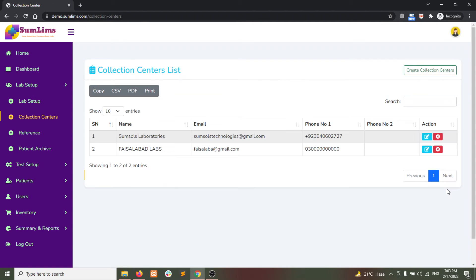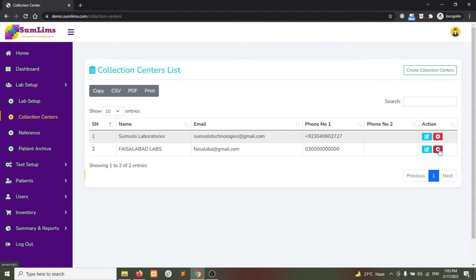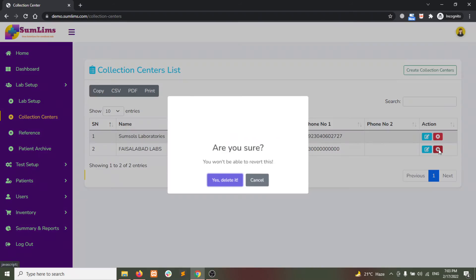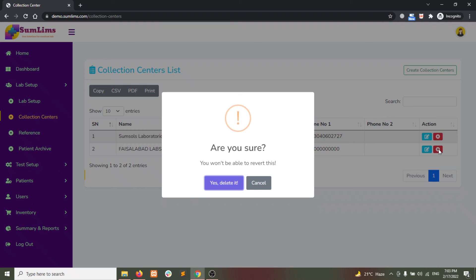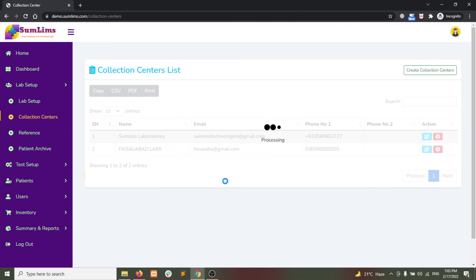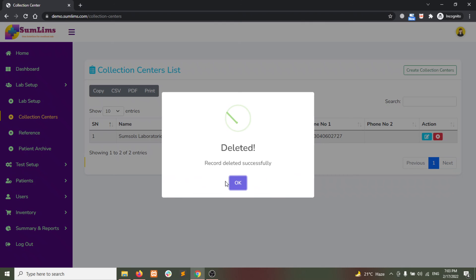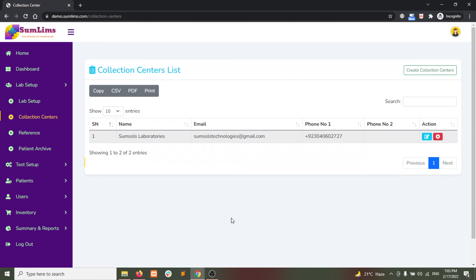Once it's saved, you can go to the collection centers again and click on the Delete button. You will be asked for confirmation. Once you click Delete, the record will be deleted from your system permanently. Thank you.